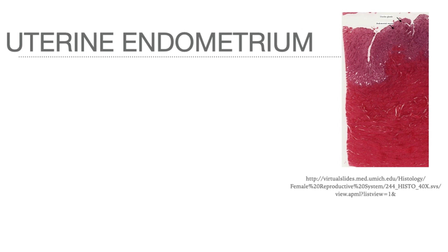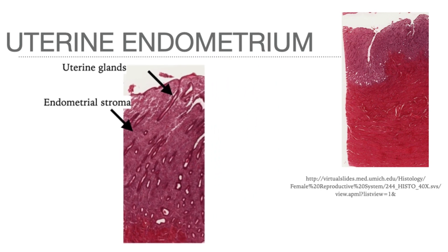Viewing the uterine endometrium at high power magnification, tubular glands called the uterine glands can be seen extending downwards from the epithelium into a very thick layer of connective tissue called the endometrial stroma. The endometrium undergoes monthly cyclic changes in histological appearance in response to changes in the levels of the ovarian hormones.